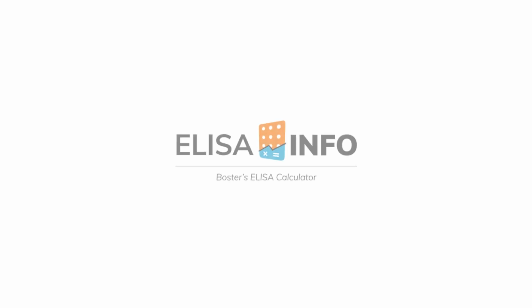Hello, and welcome to ELISA Info, Boster's ELISA calculator. This video will give you a brief overview on how to use this tool to get the most out of your ELISA experiments.